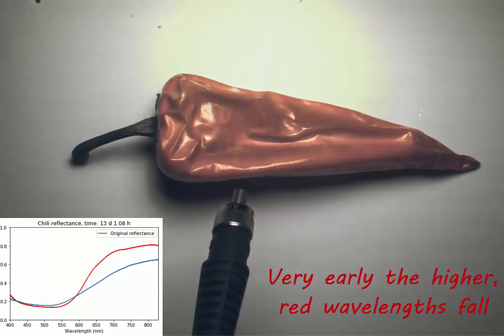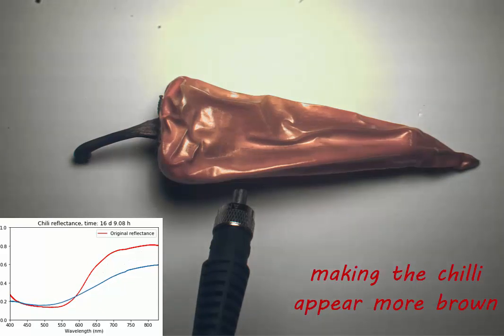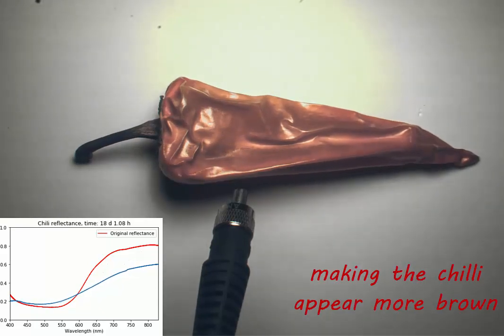Initially, the chilli looks very red, which are the higher wavelengths, but these begin to fall, making the chilli appear more brown as it ages and dries out.